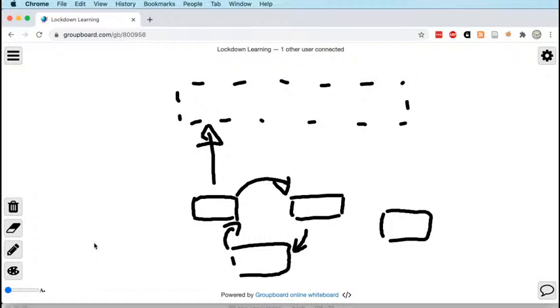So you have to think about the relationship not between your reads and the reference genome, but between your reads and each other. Without the reference genome, we have to think about the relationship of the reads to each other, and that is the essence of de novo genome assembly.